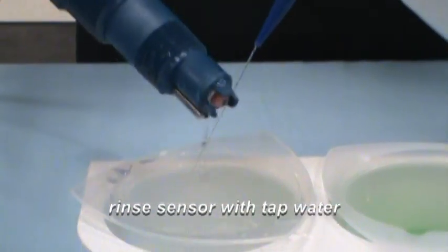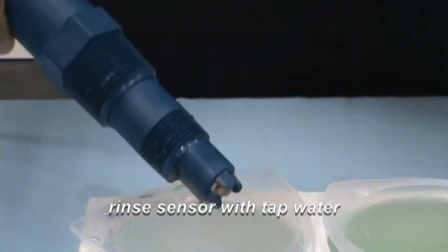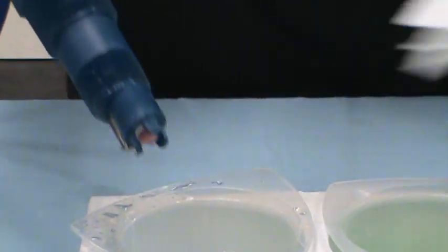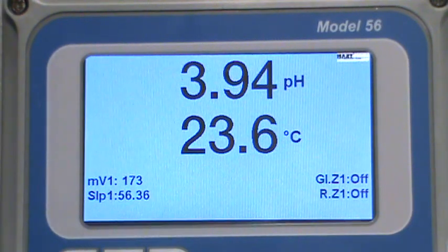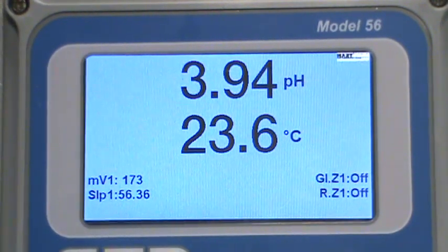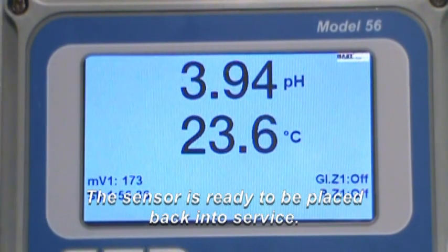Rinse the sensor in the rinse beaker. Pat the sensor dry with a soft cloth or tissue. If the sensor is calibrated successfully, the instrument will not display any error messages. The sensor can now be placed back into service. And that's how you calibrate a pH sensor.